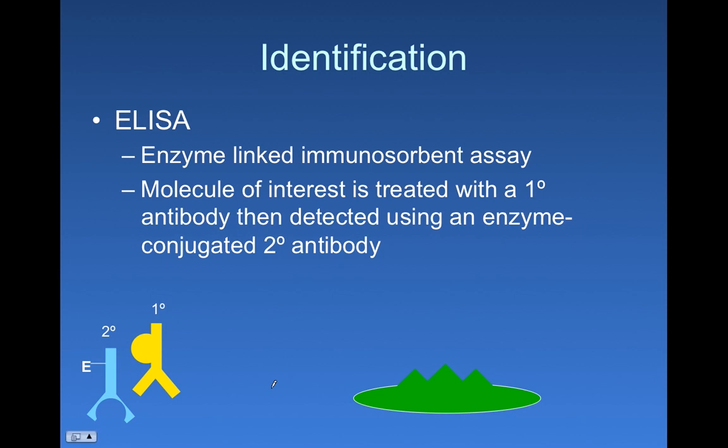There are other types of antibody preparations called monoclonal antibodies, and we might talk a little bit about how you make those in class. Okay, so now we have an antibody that can bind to the Ebola protein, and that antibody is a rabbit antibody. And so the constant region of that antibody is really distinctive for a certain class of rabbit antibodies. So what we're going to do is we're going to take a bunch of patients, and we're going to take their blood, where we think the Ebola protein might be if they're infected, and we're going to spot it onto a membrane, piece of filter paper or something, so that that patient sample stays in place.